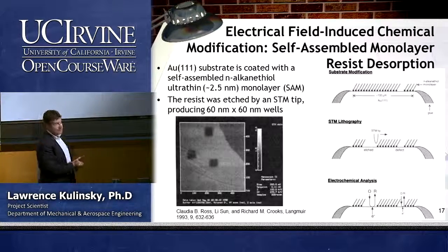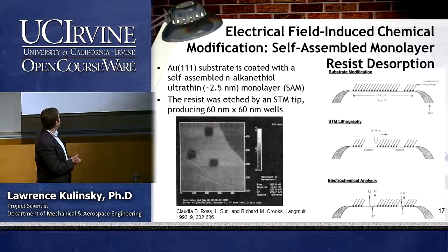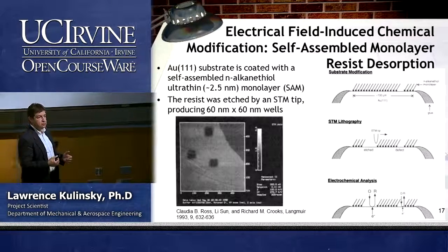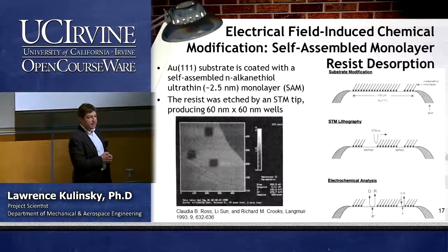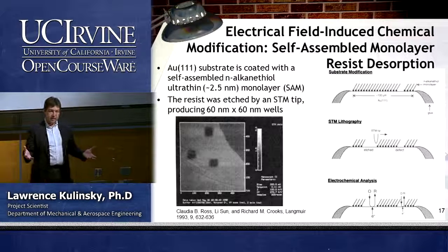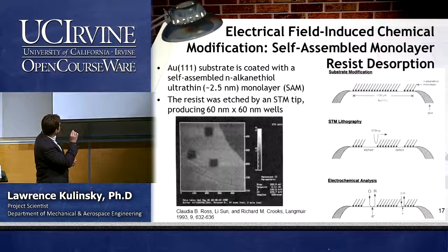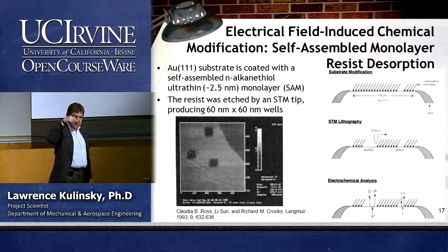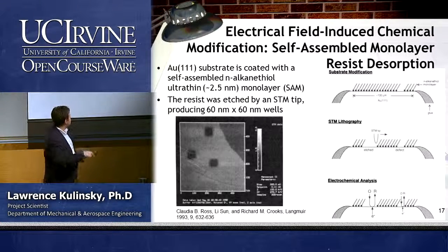Okay, so speaking about surfaces that cannot produce oxide, or alternative ways of doing lithography, we can use a very thin resist made from a self-assembled monolayer, SAM. So we have an alkanethiol, ultra-thin monolayer on the surface of gold. And basically, as the tip goes close to the surface, it pretty much shaves the monolayer, and you produce a window.